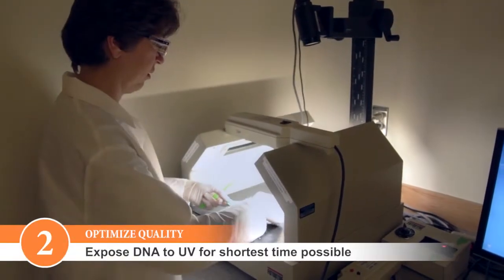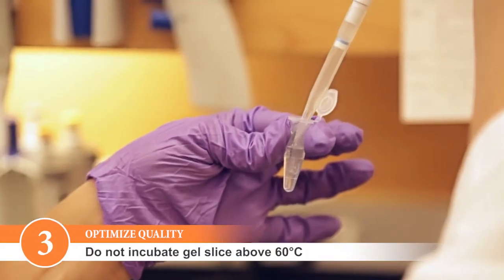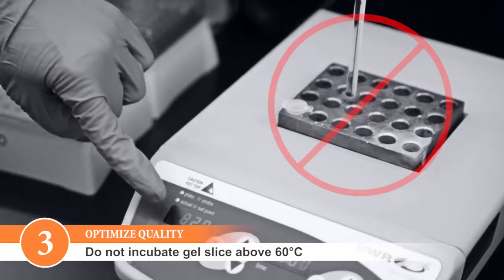Try to limit UV exposure of your DNA to avoid damage. Do not incubate the gel slice above 60 degrees Celsius, as this may denature the DNA.